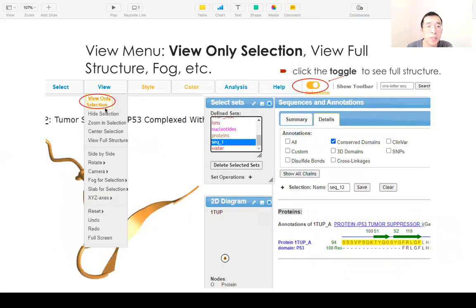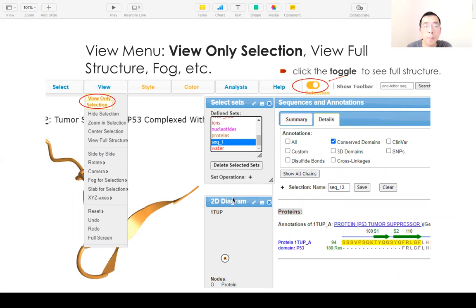If you click the view menu, the first option is 'Only Selection'. It will display only your selection in 3D, highlight it in 1D, and show only your selection in 2D. Your selection will also show up in the defined sets. If you click the toggle, it will show the full structure.